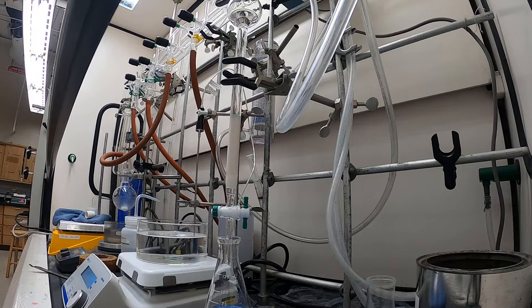You'll notice now that there is a slight blue color at the top of the alumina, which is the removed copper. Since only a few milligrams was used, it is fairly small. After passing the reaction mixture through, you can concentrate down the polymer solution and purify the polymer using precipitation or another appropriate method. That is all for this video.